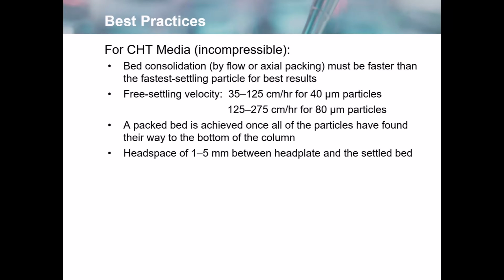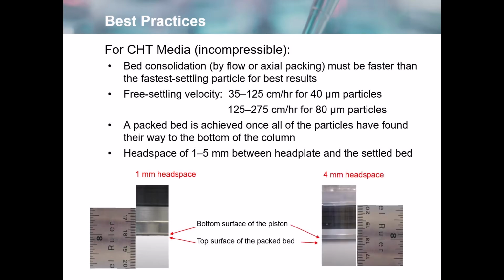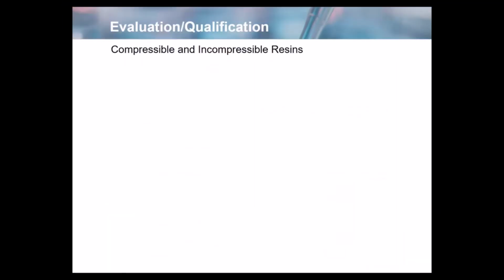Again, you want to leave a slight headspace so that you don't crush the top of the bed. We recommend a headspace of 1 to 5 millimeters between the head plate and the settled bed. Here's an example of a 1 millimeter headspace. And here's an example of about a 4 millimeter headspace.